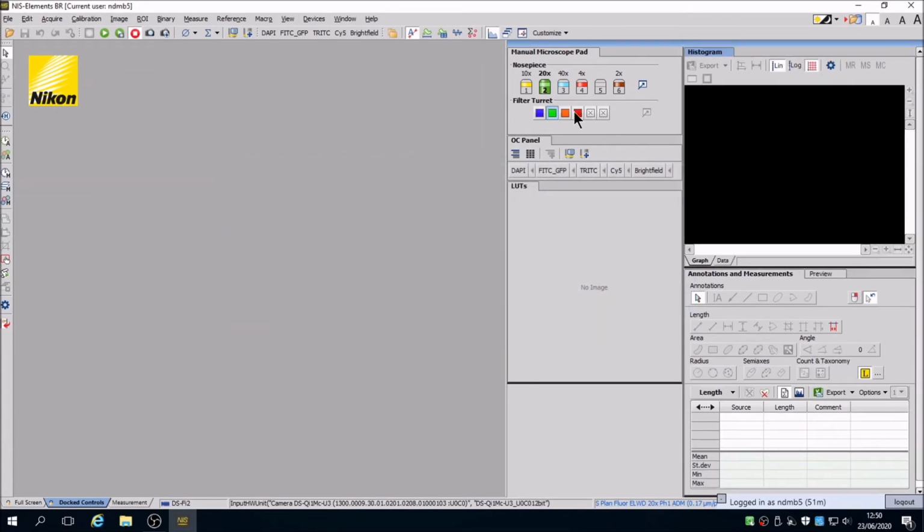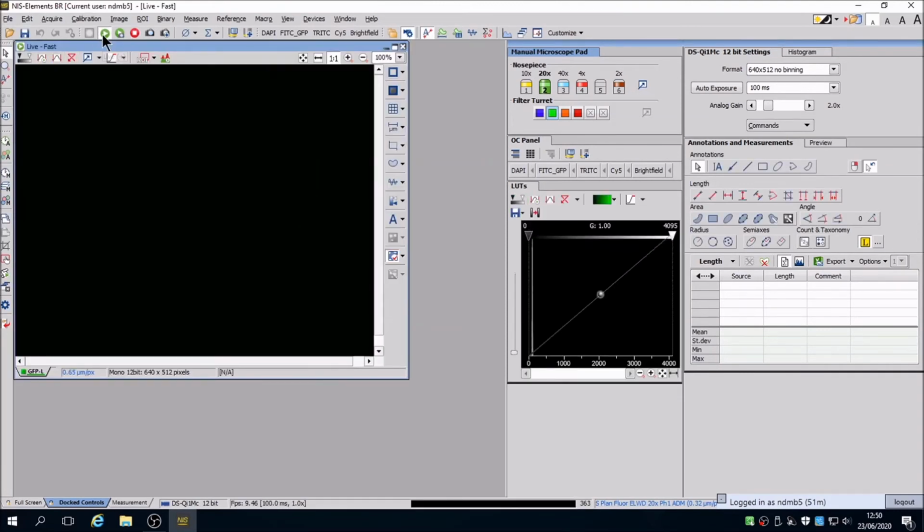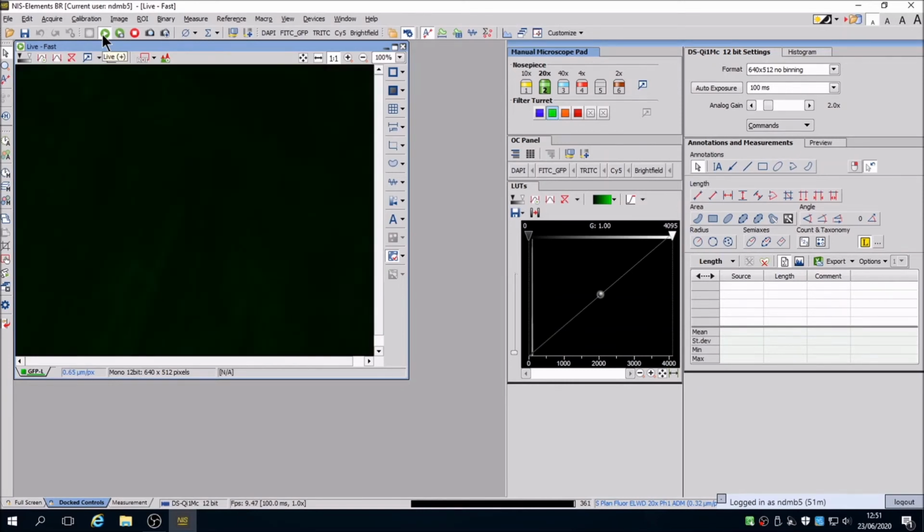Going live on the camera shows no image. Ensure that the fluorescence LED is active by opening the shutter button on the control pad beside the microscope. You should see blue light illuminating your sample in this case with the GFP filter in place. As you are using a different camera, you will need to rotate the port knob to position 5 to direct the light to the left side port.